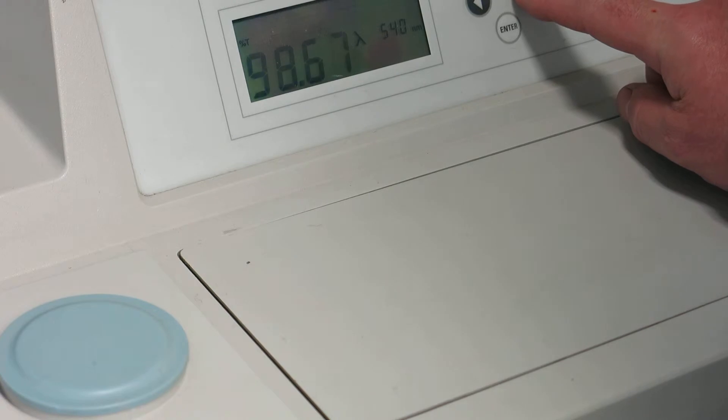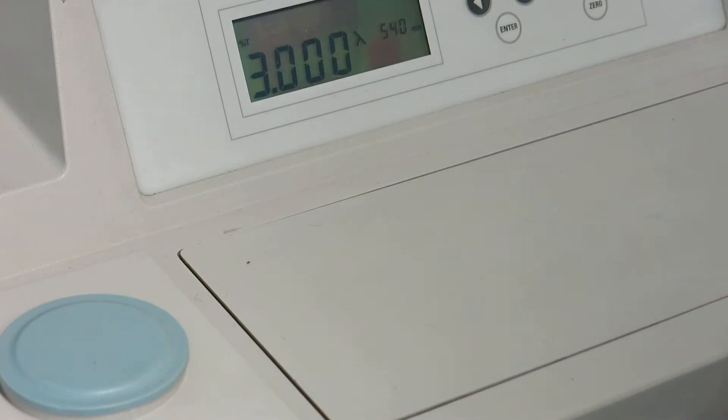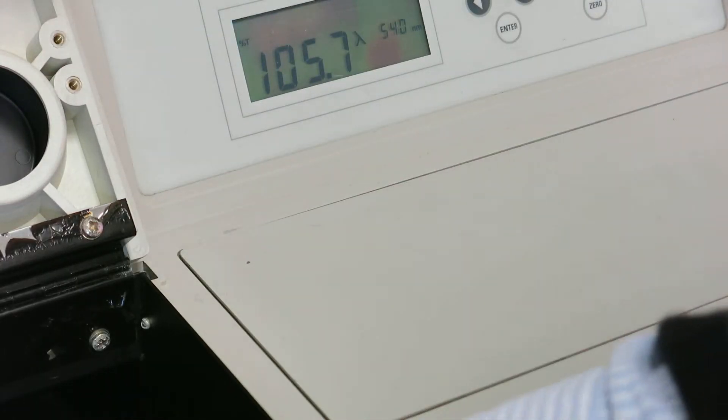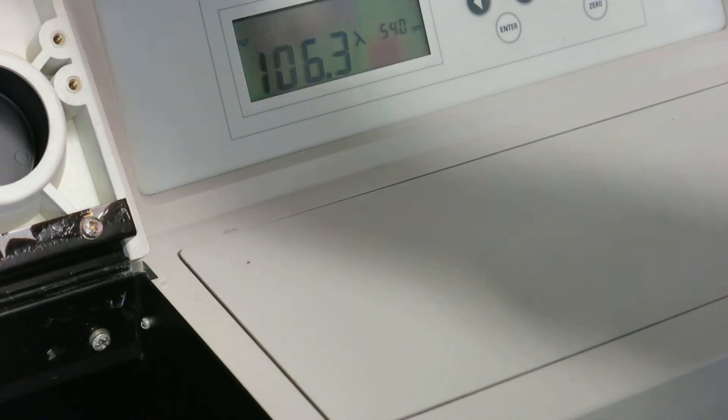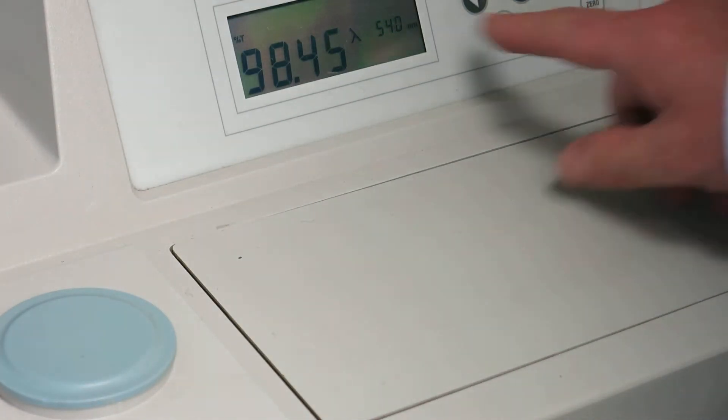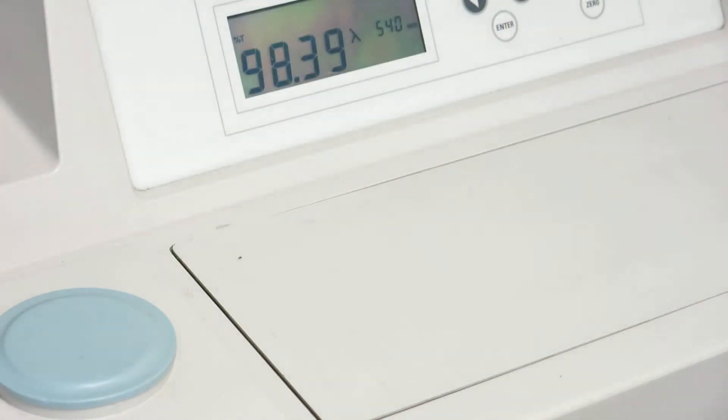So this gives you some sort of an idea there. This is the inside of the instrument here. You can see you've got the cuvette holder here.